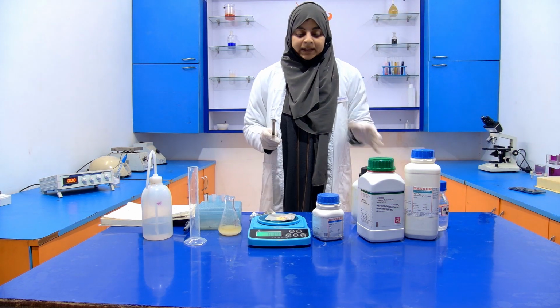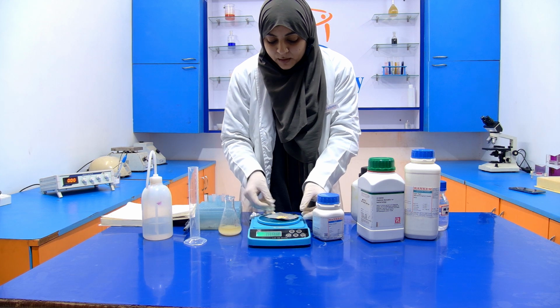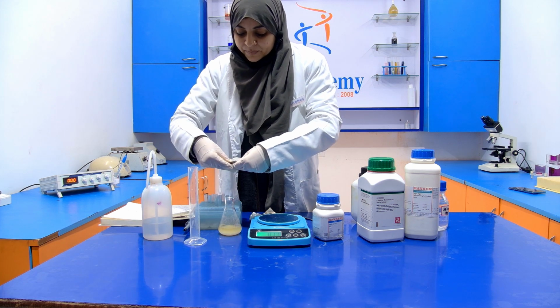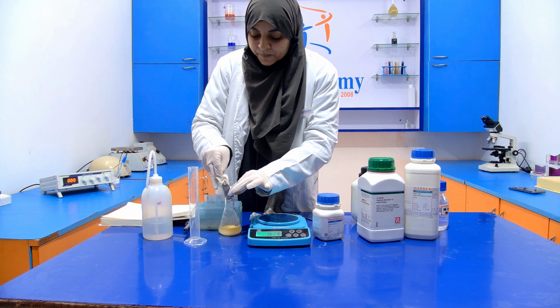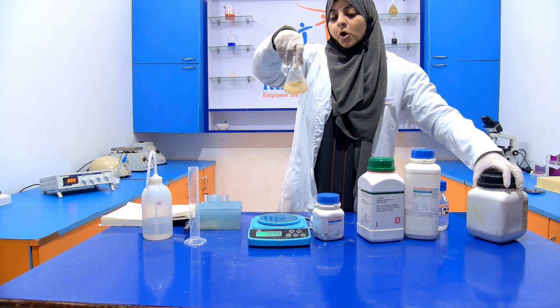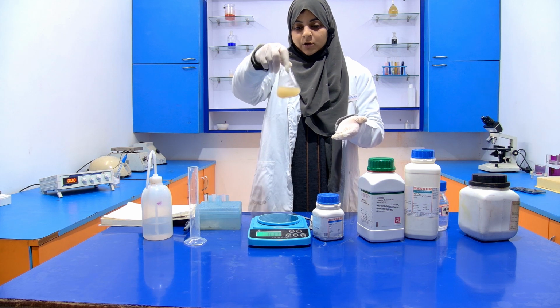Now after taking the weight of the beef extract, that is 0.34, we have to add it into a conical flask in which all the ingredients are already present, and along with it 50 ml of distilled water are also present. Now we have to mix it properly so that all the ingredients are completely dissolved into it. See, it is completely dissolved.